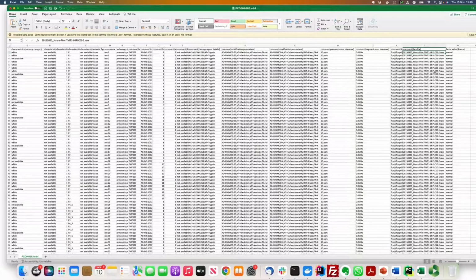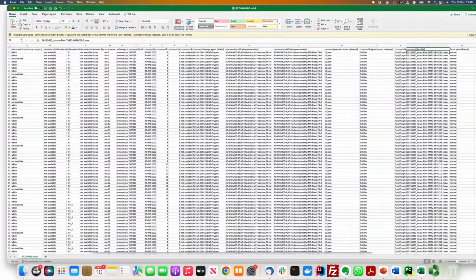And then it will trigger with the same parameters. It knows what the precursor mass and the fragment tolerance are, and the PTMs, and it will trigger a search step, let's say with Comet, MSGF+, and so on. Because it knows all the experimental design, it knows what channels are there. Because of that, it performs the quantification on each channel, and at the very end it has the experimental design to perform the differential expression analysis using MSstats. And that's actually the beauty of starting from this.